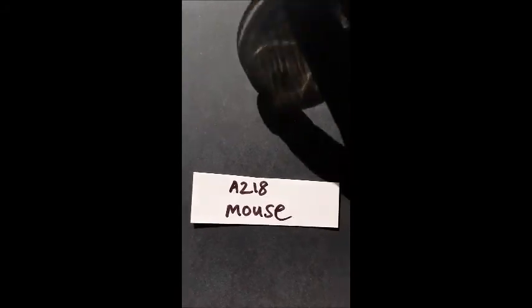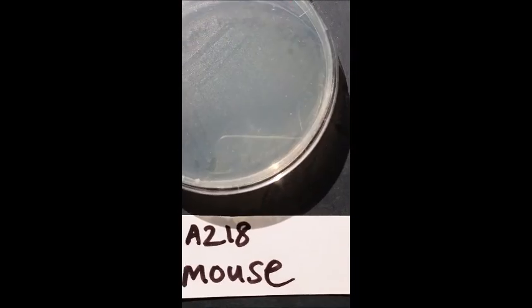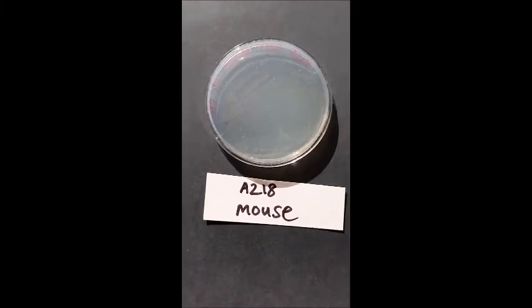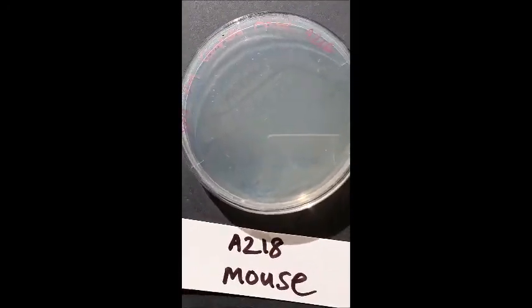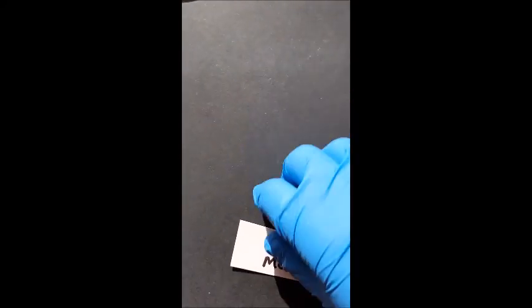Next we'll look at the computer mouse in the biology lab. Look at that. I can't see one colony, which goes to show that the sterilizing that Mr. Langer does works. He always wipes down the mouse and keyboard, and all the teachers do, I think. Well, many of them do. It's working. There is no growth on that. You saw me swab the mouse, I got it all over. So, no colonies on the mouse.